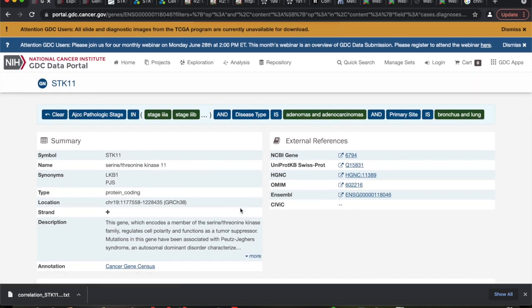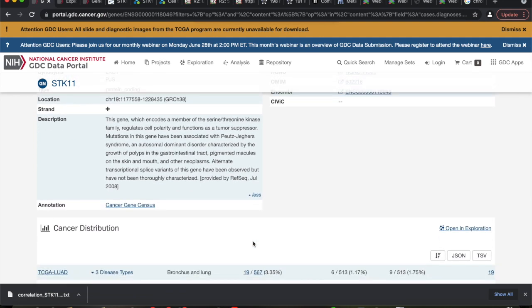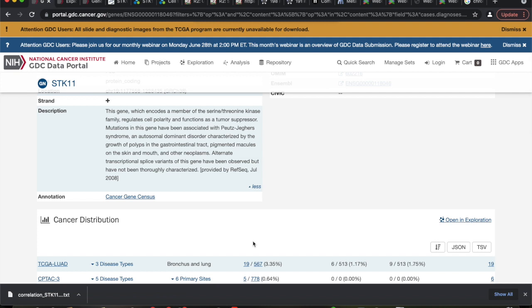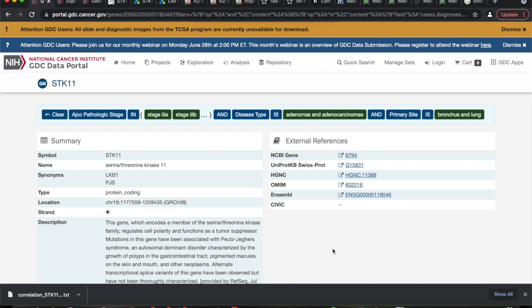Going back to the top — this gene is also known as LKB1, so keep that in mind. If you read the description, sure enough we get background on our good guy: it regulates cell polarity and functions as a tumor suppressor, and has been associated with other cancers as well. Everybody bookmark the TCGA webpage — keep it in a folder for bioinformatics. Go back and play around with it; it's not that hard to use.